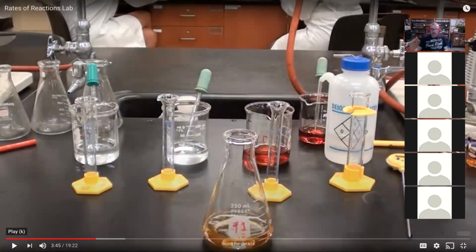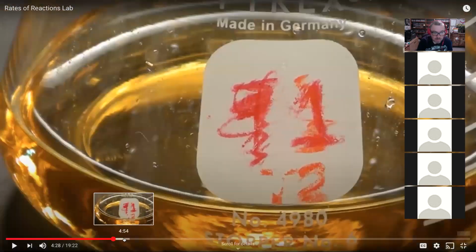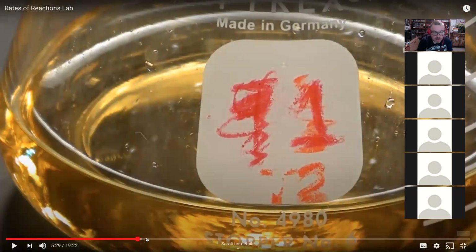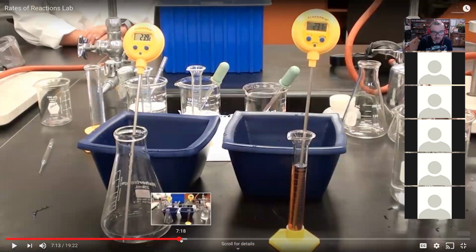You'll notice that initially the solution is brownish or yellowish because of that iodine that goes in there. But understand that the initial concentration of that iodine is the diluted concentration, not what was in the container. That's because it was 10 mL, now it's been diluted into 50. Now, as the reaction proceeds, I won't show the whole thing here, but you can see that as it goes, it gets lighter.